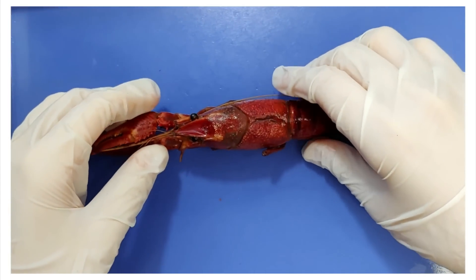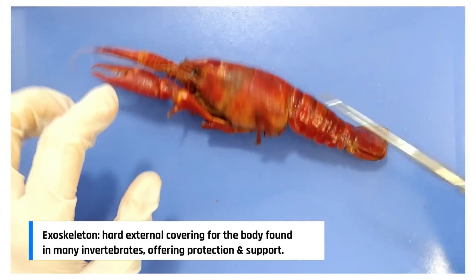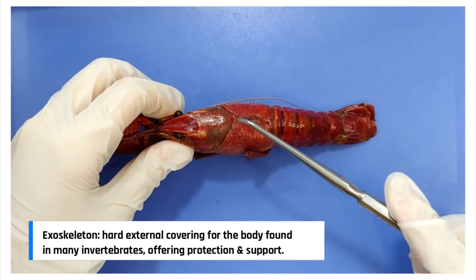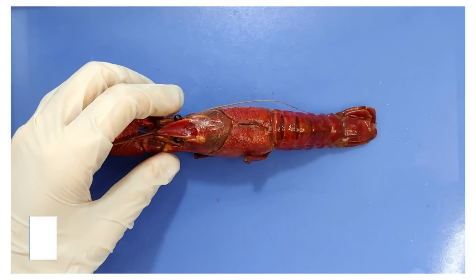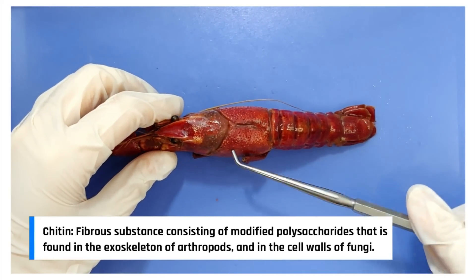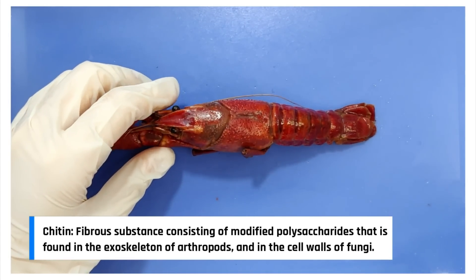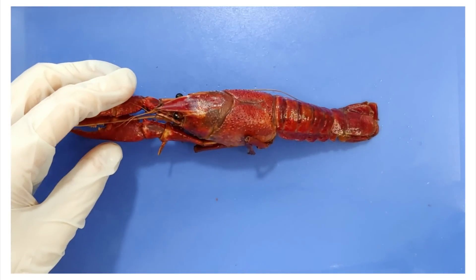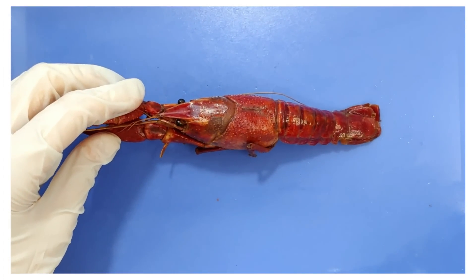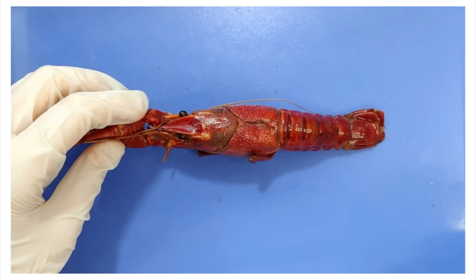Other characteristics of arthropods include a hard exoskeleton, like the one you see here. It's made of a compound called chitin. The exoskeleton supports and protects the delicate soft tissues of the crayfish, which lacks an internal skeleton. You can think of this as being encased in a full suit of armor, except you also have no bones. It's a bit of a trade-off.